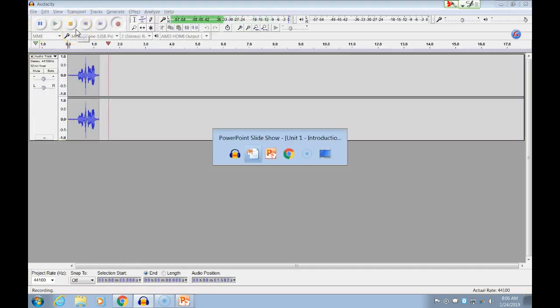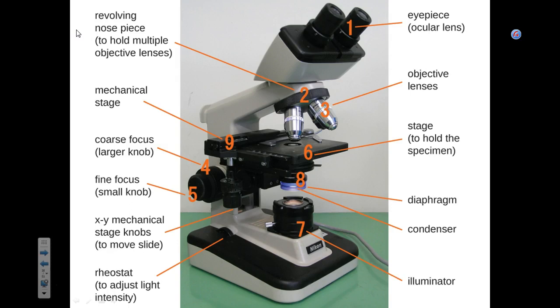We have started to talk about microscopy, and we talked a little bit about different concepts underlying microscopy. Now I want to remind you, and I believe you did work with microscopes on multiple occasions, just to remind you what the different parts of the microscope are. Yeah, you have to know what different parts of the microscope are doing.